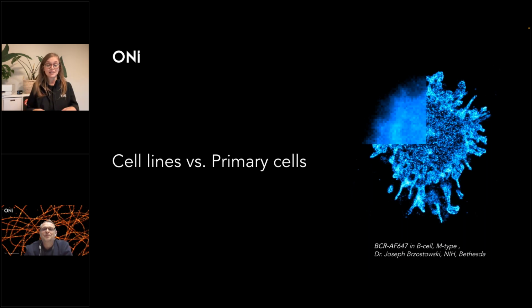How should we compare? Photobleaching is always basically happening, and it depends on your laser power and the presence of oxygen. In conventional microscopy techniques, you are using lower laser powers with higher exposure times, which means that you are collecting the light from your protein of interest for a longer time, but you are not bleaching your sample. That's how you can prolong your imaging.